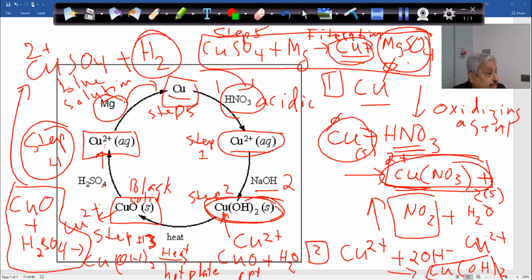Everyone's following? So we have to have a mild temperature, maybe about 80, 90 degrees, just to evaporate the H2O coming out. The H2O, so about 90, 100, yeah, so 100 degrees. But we will not put a higher temperature because we are afraid that the filter paper will be really barbecued, and that will have a big error inside the mass of the whole thing.